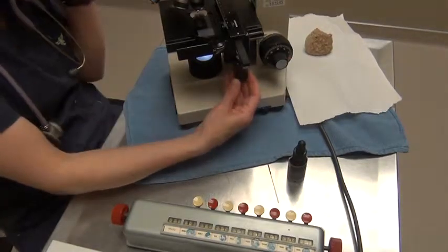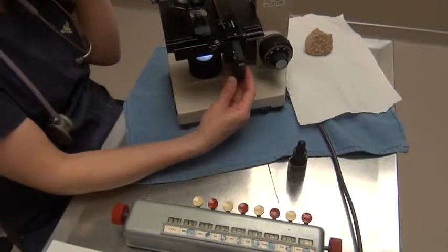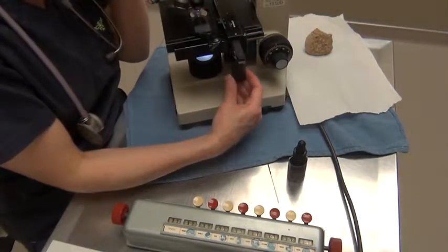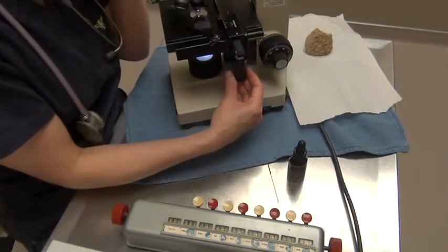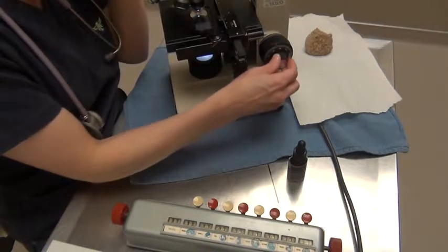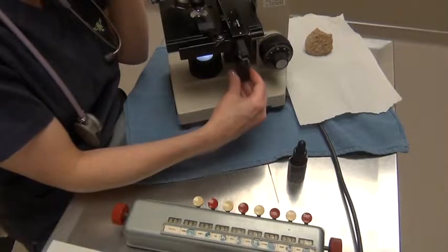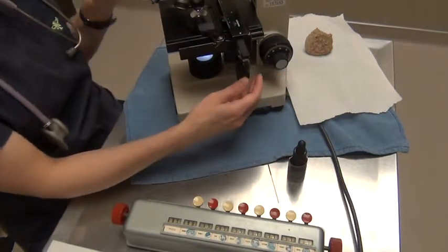Alright, so I can kind of gauge where I am. I'm up in the dense body layer, so I'm going to move down a little bit. And I want to find where I've got some good spacing between the cells. But I don't want to go out to the feathered edge yet. I'm just going to kind of look around in this less dense field, which I do have a bit more spacing here in my count area.